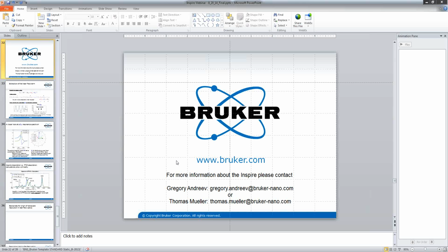In absorption, the sensitivity is a little bit less, maybe around 5%. But the combination of reflection and absorption together would allow you to unambiguously identify materials with rather small optical contrast.